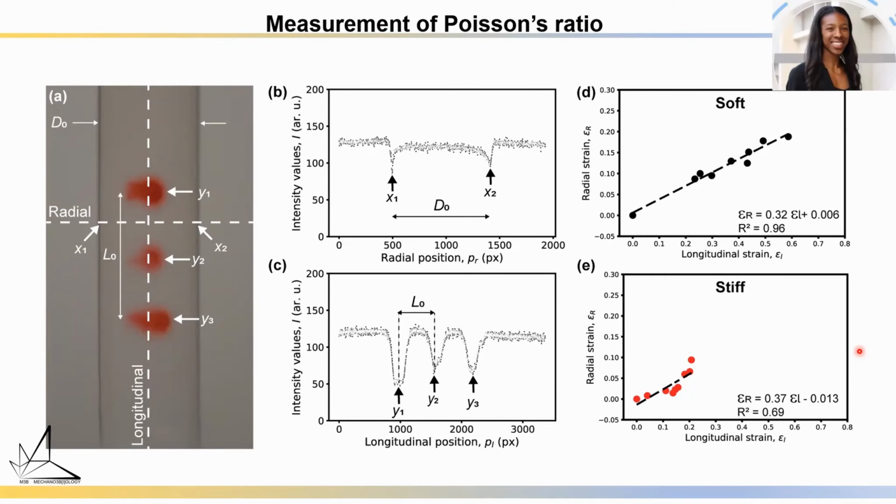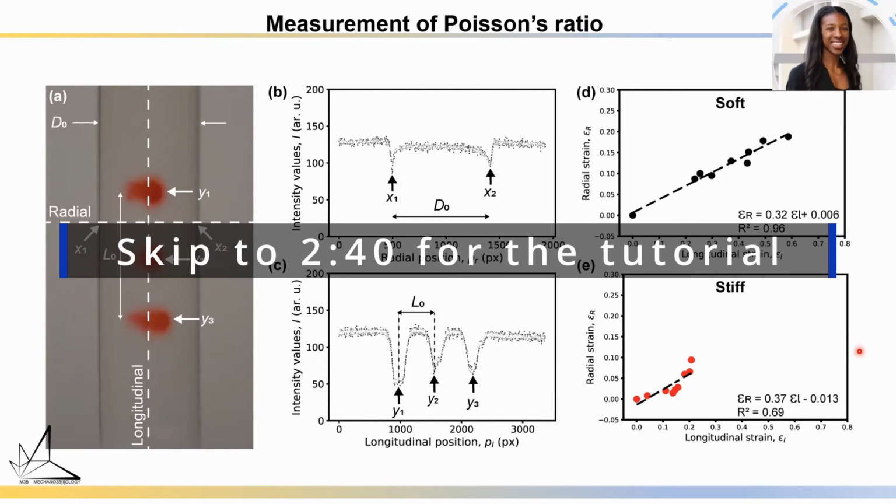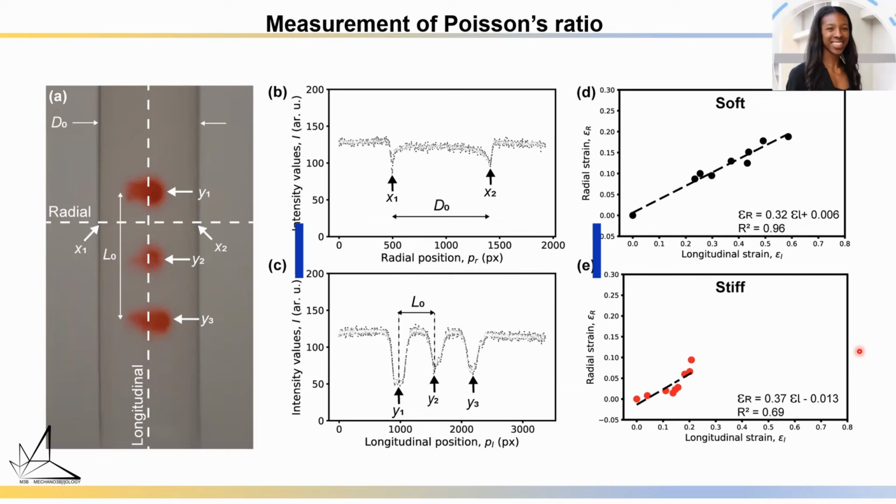Hello, my name is Ariel Smith. I am a fourth-year PhD candidate in the mechanobiology lab at UC Merced. My research involves determining 2 out of the 3 important elastic constants for substrates used in cell mechanics and mechanobiology experiments, such as traction force microscopy.